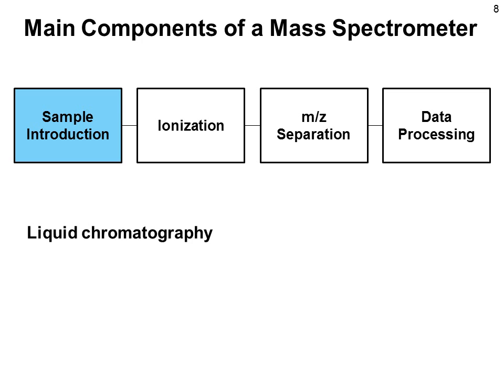While liquid chromatography is a very powerful separation technique, it is generally not sufficient to separate each and every molecule in a complex biological sample such as blood, serum or urine, as there may be hundreds of thousands, maybe a million molecules. Nevertheless, liquid chromatography mass spectrometry is to date the most powerful combination of separation and analysis techniques for complex samples. Laser desorption, we will hear about that. We can introduce molecules into a mass spectrometer by shooting a laser at a crystalline sample. This sample will absorb light, and thus, due to the energy of the laser, ions will be formed.